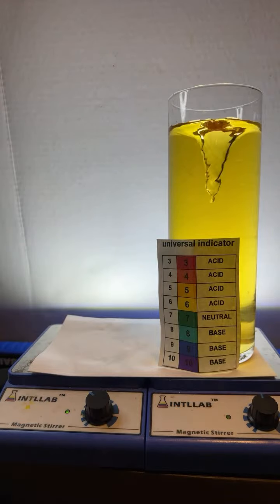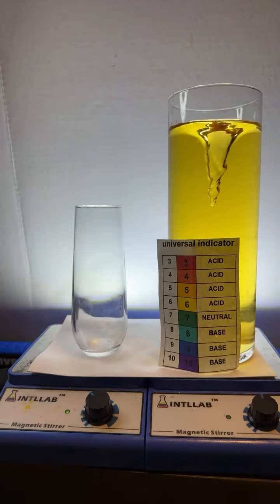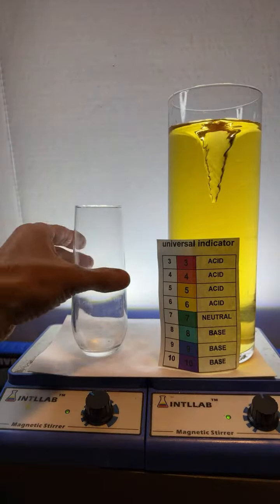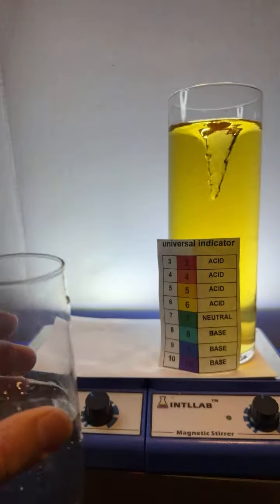I hope I have a clean flask, because this only works if the flask is clean. I don't know if it is or not, but we're going to find out pretty soon. I'm going to add distilled water to this flask. Actually, I'm going to rinse it out first, just to make sure.